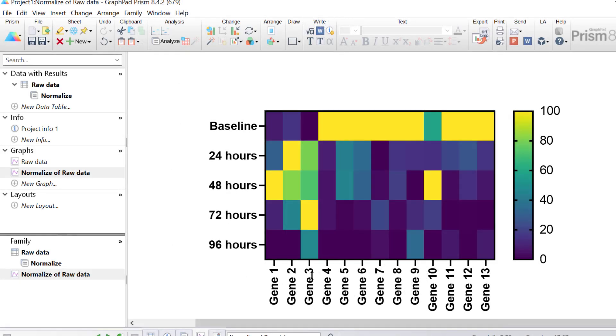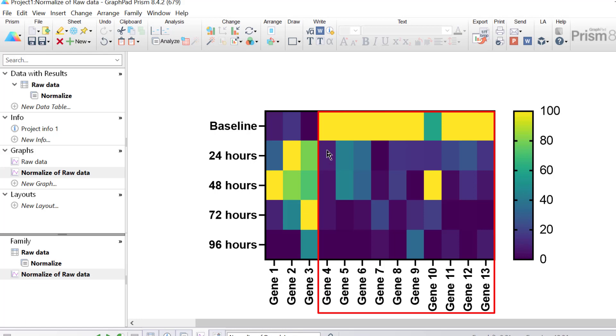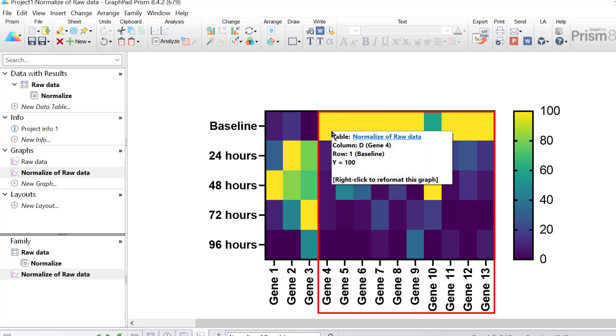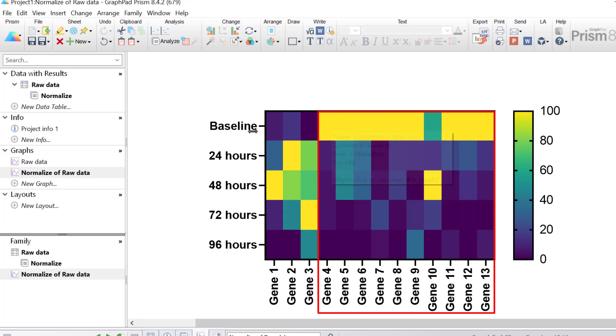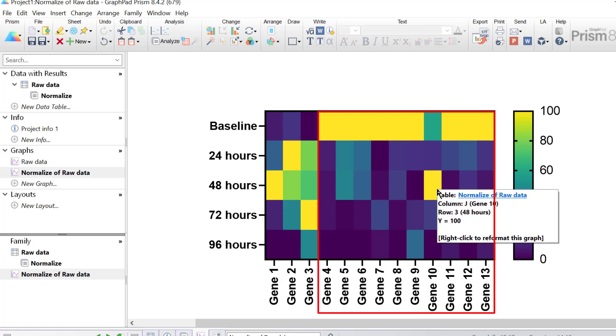Genes 2 and 3 also follow this rise and fall pattern, but genes 4 to 13 mostly start with their highest gene expression at baseline, indicated in yellow. And then as the time goes on, there is a down regulation, and there is a little exception here for gene 10 at 48 hours, where there was an up regulation.